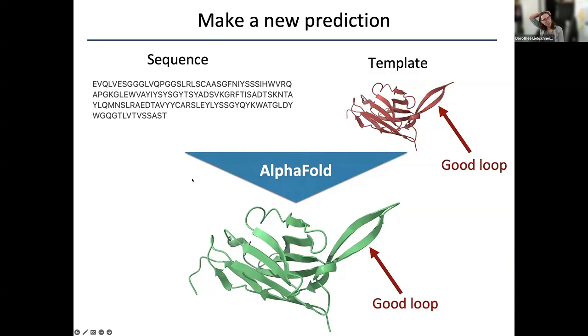So what we've just achieved by doing this is we indirectly supply information of the experimental data into AlphaFold. I'm saying indirectly, right? AlphaFold doesn't have any way right now to, let's say, take a map and use the information from the map in the prediction. It's indirect because we give it in the form of this model that fits the density. But yeah, it is quite astonishing that it can then make a better prediction.